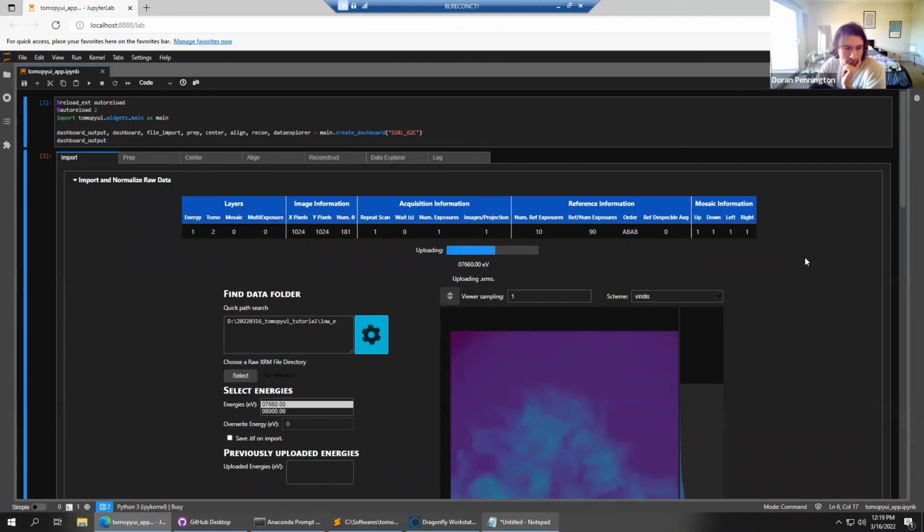So in general, the workflow is to iteratively center the feature that you're trying to look at, right? Yeah. So you go through that alignment step several times. Is the median filter something you always have to do, like median filter it, align it, and then take the filter off?